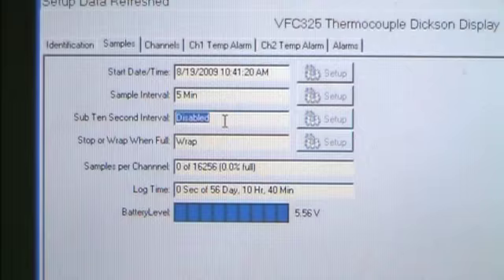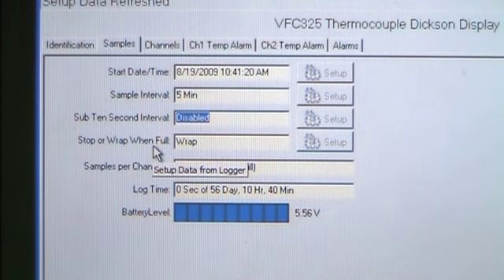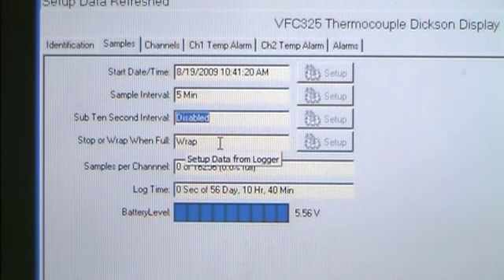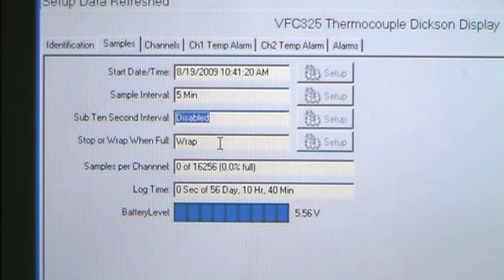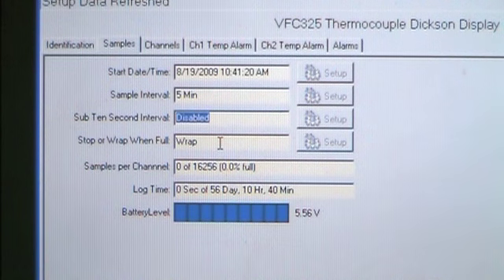The Sub 10 second interval is disabled and unavailable on this unit. Next is the Stop or Wrap when Full section. The default on these loggers is set to Wrap. Once the logger becomes full, new data will rewrite over old data. Put a process in place that allows you to download the temperature data at consistent intervals so that you don't lose any temperature readings.